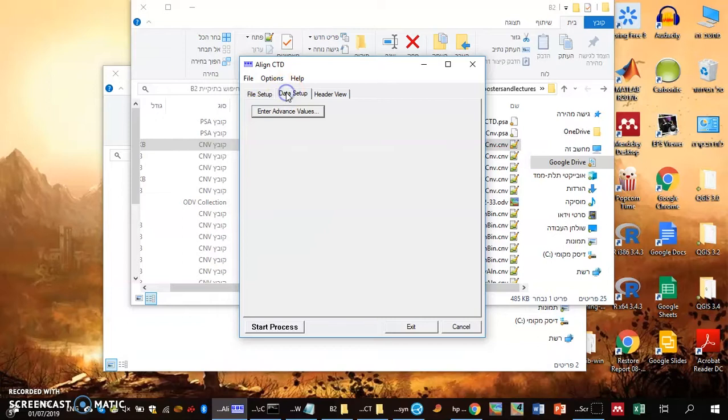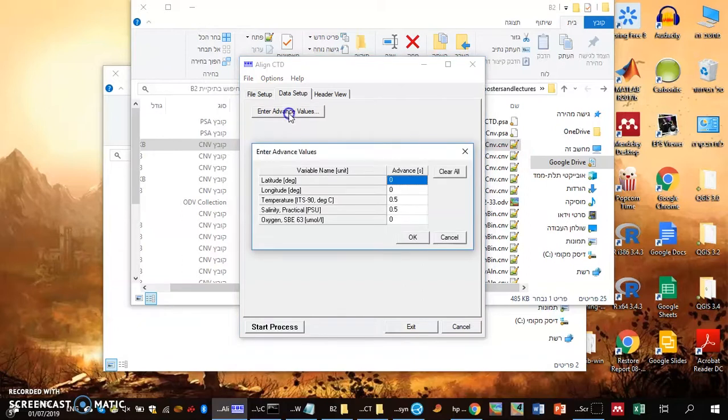As I go to the data setup, I can enter the advanced values, and that might help you understand why we do that. Different sensors are mounted at different places, so they measure different depths at every time.